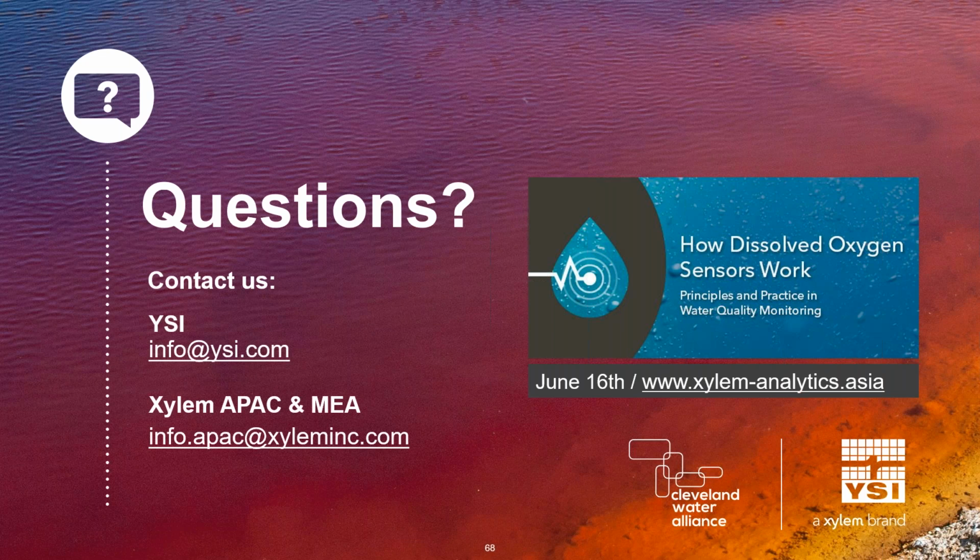So basically, we have something called a size to charge ratio of ions. And a lot of times, if you have an ion that looks similar, like let's use the chloride ion, because we have a chloride ISE. A chloride ISE, a lot of things look like chloride. And when you're in salt water, a lot of things look like chloride. So it's basically overwhelmed with signal from too many sources.